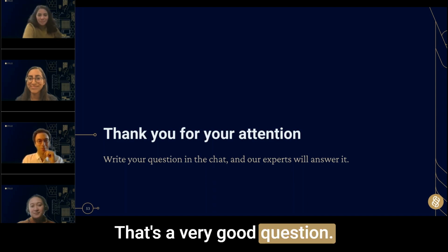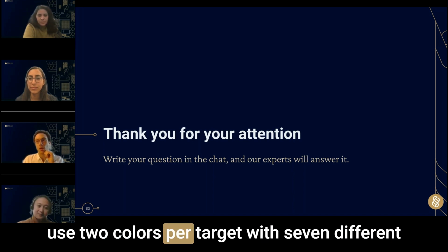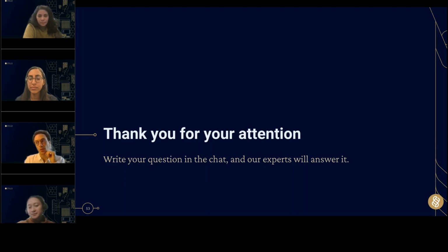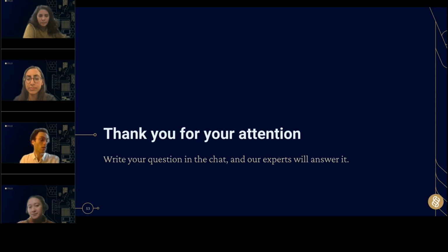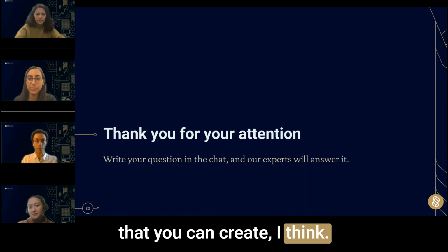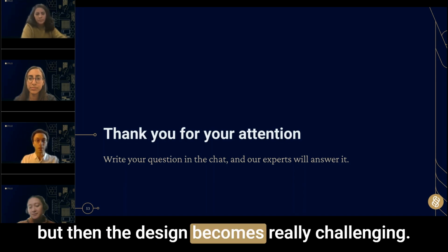That's a very good question. That is something that we have never tried before. From a purely theoretical point of view, if you use 2 colors per target with 7 different colors, you can have 21 different populations. If you increase that to 3 colors per target, let me try that, that would be 35 different populations that you can create, I think. So you can increase the multiplexing that you can reach theoretically, but then the design becomes really challenging.